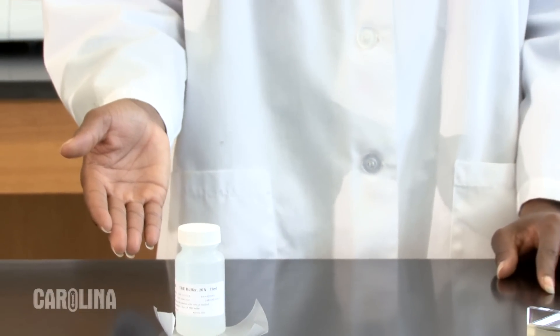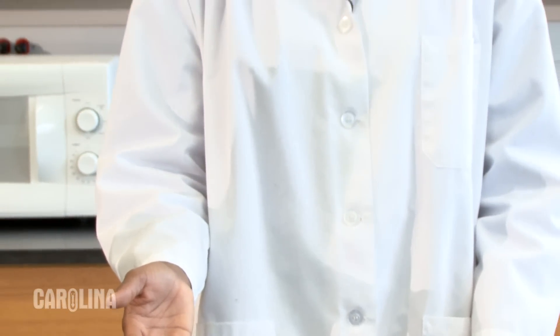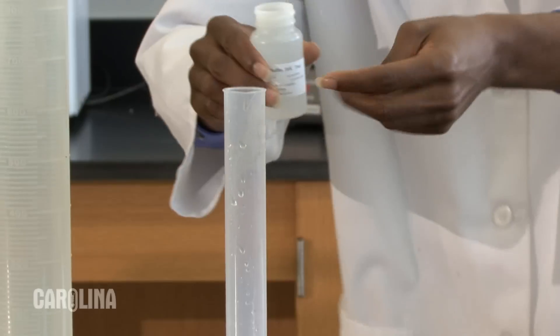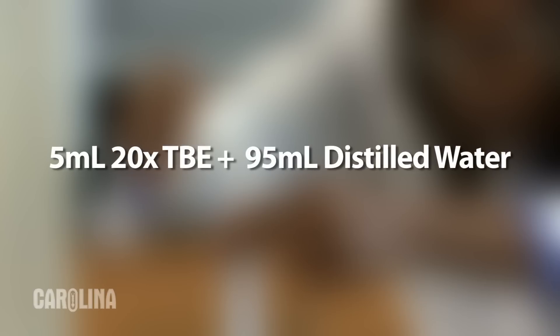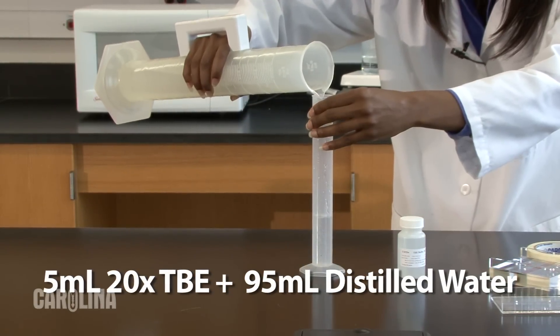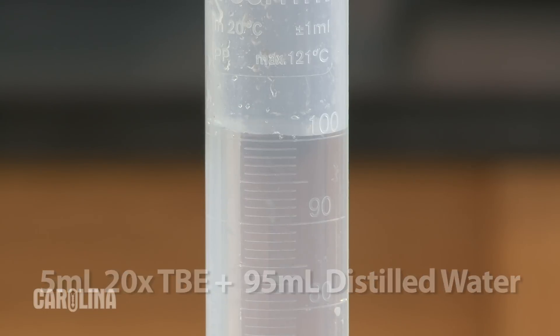Many Carolina kits come with powdered agarose and a concentrated buffer solution. Remember that the ions in the buffer are what carry the current through the gel, so the gel should be made with buffer. A 1x concentration of buffer will be used to make the agarose solution for the gel. Most often the 20x stock solution will be used to make a 1x buffer. To dilute a 20x solution, mix one part 20x stock solution with 19 parts distilled water.